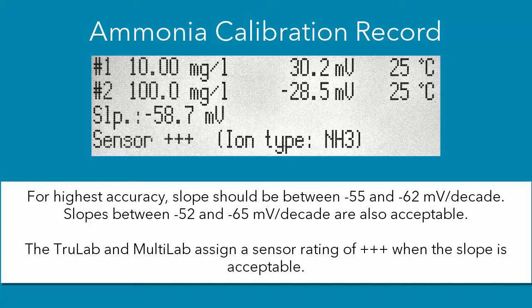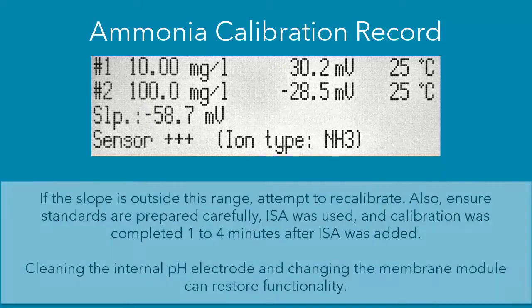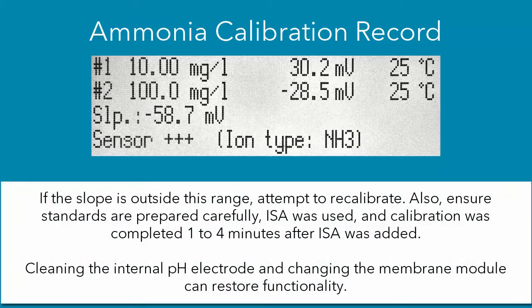So if it is between negative 55 and negative 62, then you have got a really good calibration. So for ours at negative 58.7 mV per decade, that is what we want. If you have a slope between negative 52 and negative 55 mV per decade, that will also work. However, if your slope is lower than negative 52, then you will want to perform routine maintenance such as changing the membrane module.